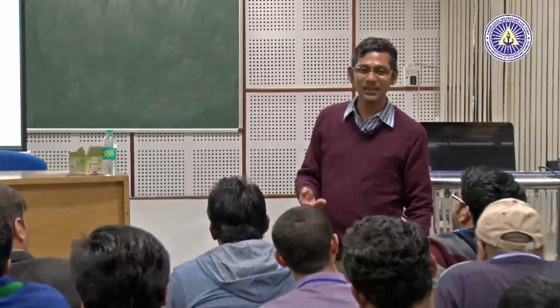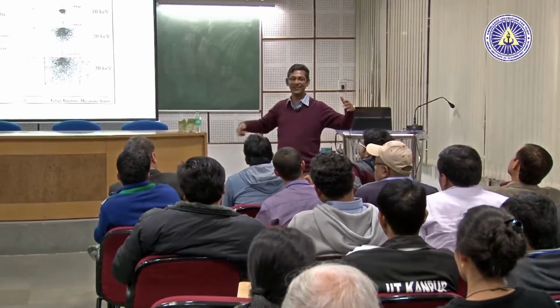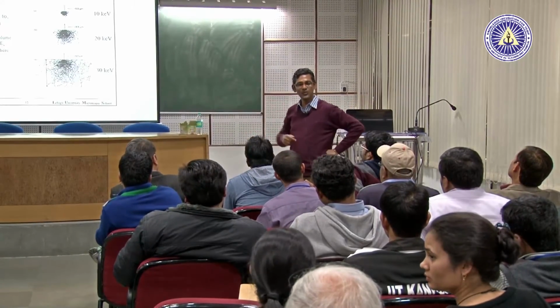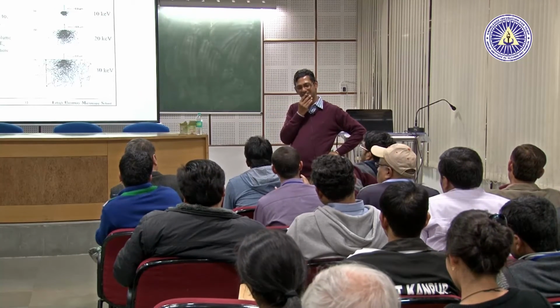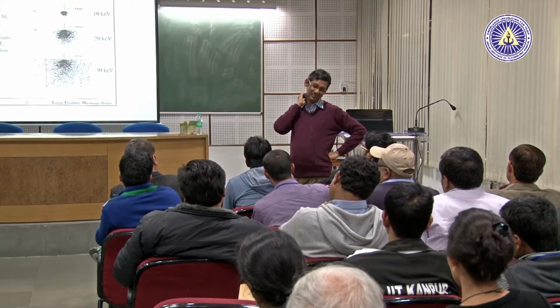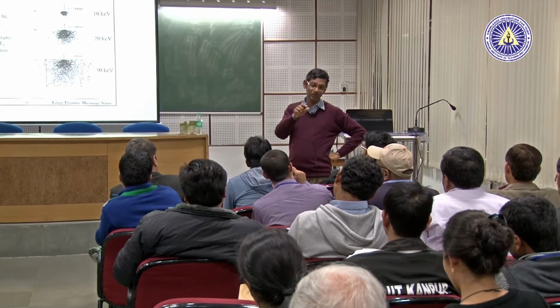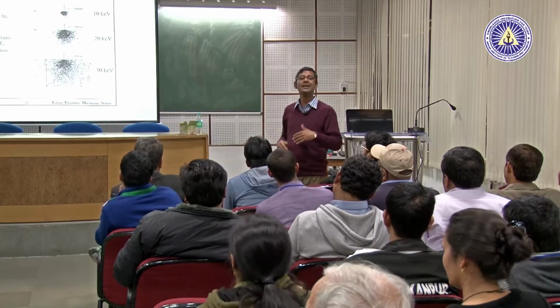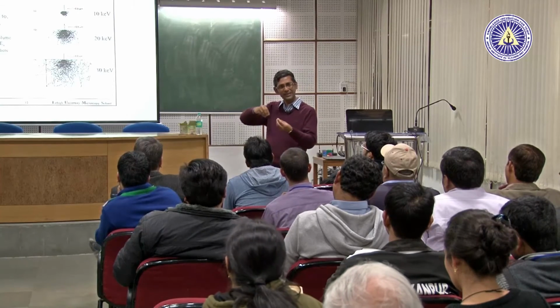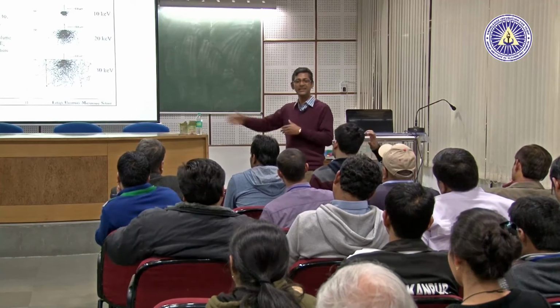How is the tunneling happening, sir? It's just like you tunnel through. Suppose there's a big tunnel, one entry, one exit. You run through the tunnel and reach from one point to the other. The same thing happens there. In superconductivity, sir, in Josephson effects, when two superconductors meet. But that is a different thing, sir. There are also some tunnel currents, but that is because of the formation of Cooper pairs. Here it doesn't form. Here one electron is tunneled through a barrier. There is a barrier, and it just passes through the barrier. It's not a free movement.